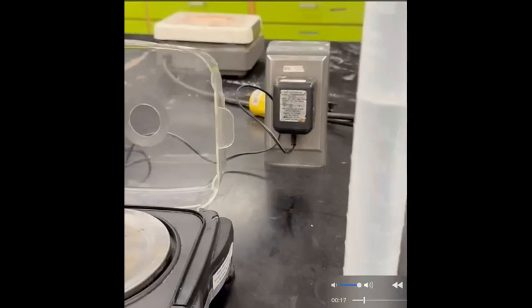I'm going to be taking you through a little bit of a lab activity where you are going to determine how much carbon dioxide is made in a reaction with Alka-Seltzer tablets and water. So let's take a look. What is an Alka-Seltzer tablet?